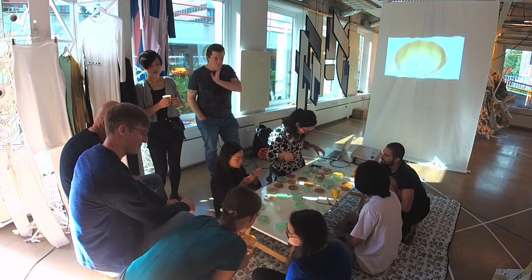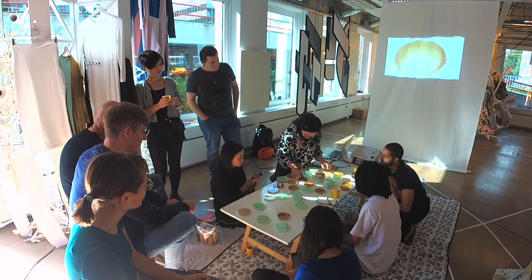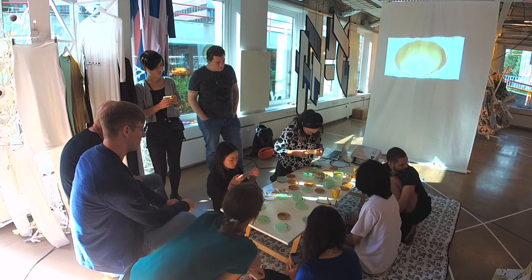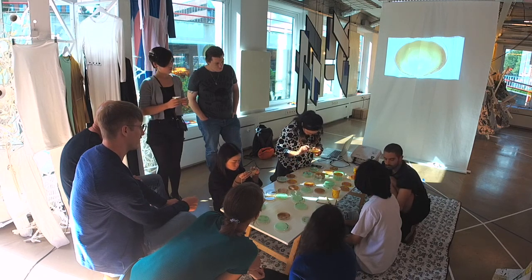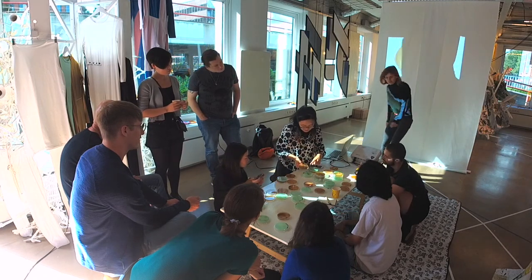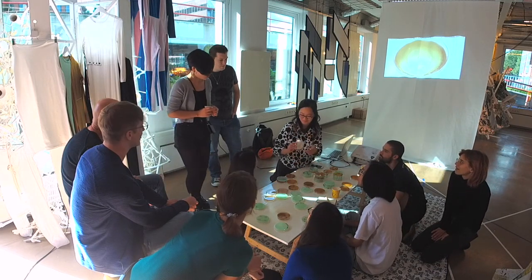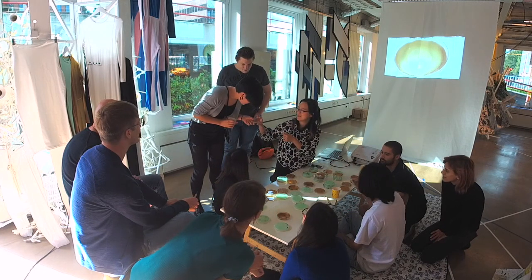It looks like a tea. I think we also have some fingerprints. This is only a little bit growing, so actually our hands, in a sense, have fewer microbes than those fruit. So I didn't seal this one, but can someone say who this is? Yours? Yeah. You have really nice 3D microbes growing.